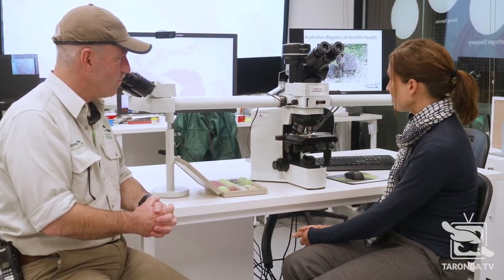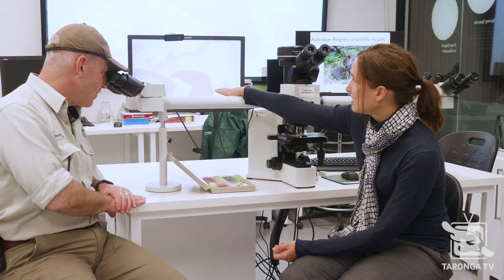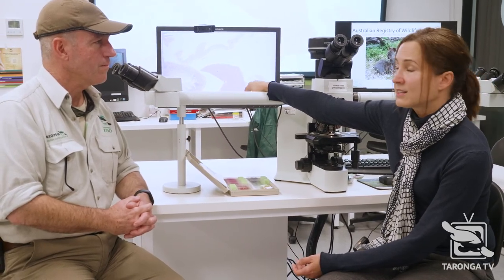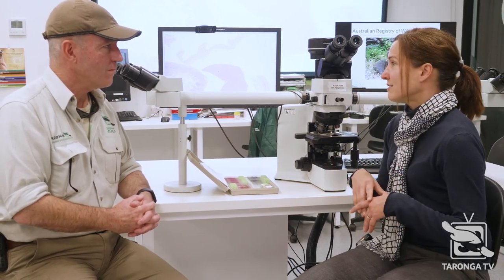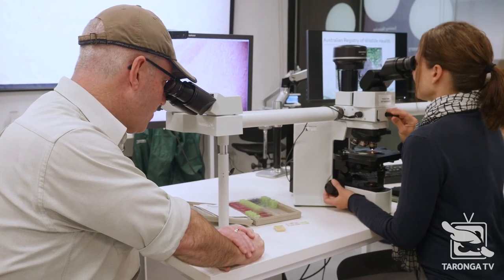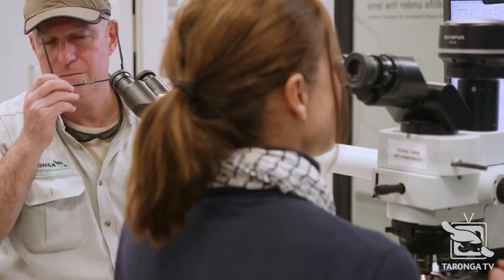Using these tools, we have a multi-header microscope now, so you can have your students looking at the same thing as you're talking. Absolutely. And we can also do high definition broadcasting through a web conferencing software called BlueJeans that the zoo has. That allows us to communicate, because this is a very visual science, and in order to inform other diagnosticians around the country and around the world about what we're seeing emerge right now from wildlife, we need to show them. So we need to capture images and share those on web conferences, through publications, conferences, absolutely every form of communication we can.